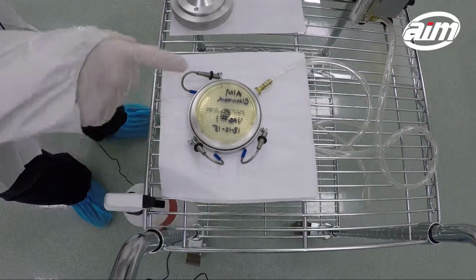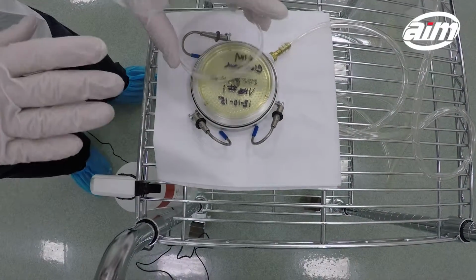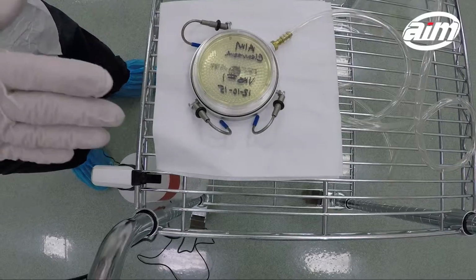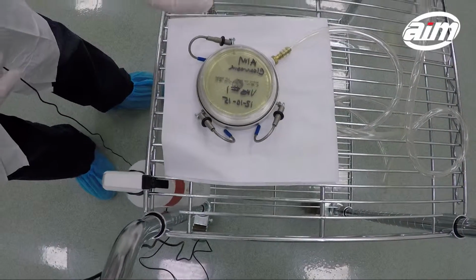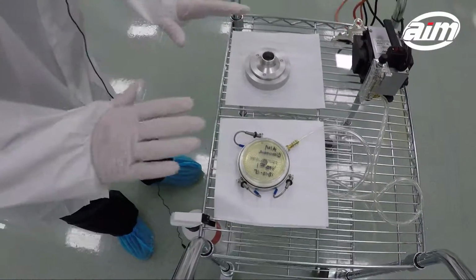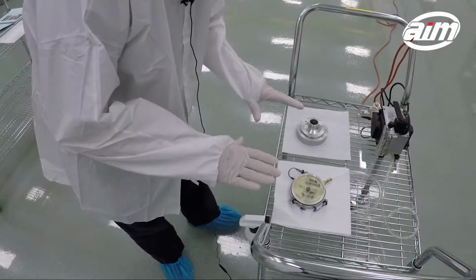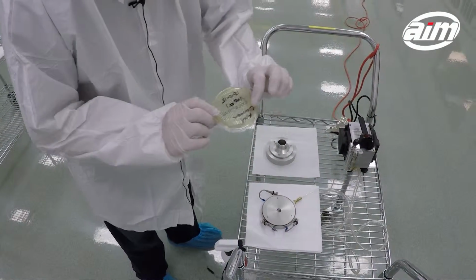And as you can see, there's little bumps on the plate. That tells me that the pump and impactor did its job, that it drew air through all those microscopic holes, providing an equal distributed amount of air over the plate. And you can actually visually see that on the sample plate.